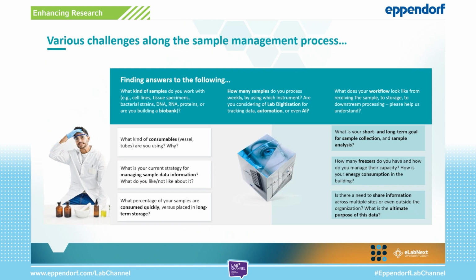Another example is, all of these hundreds and thousands of compounds that you're collecting, you're storing them in freezers and fridges and all of these places. When you know where these things are located, when you can access them and so on, you're spending less time looking for them. But most importantly, you're not opening and closing freezer doors left and right and letting the energy out, and this can have a ripple effect in a large corporation and big pharma when you have hundreds of freezers. When all of them are opening and closing every day, this can rack up the bill within the building.